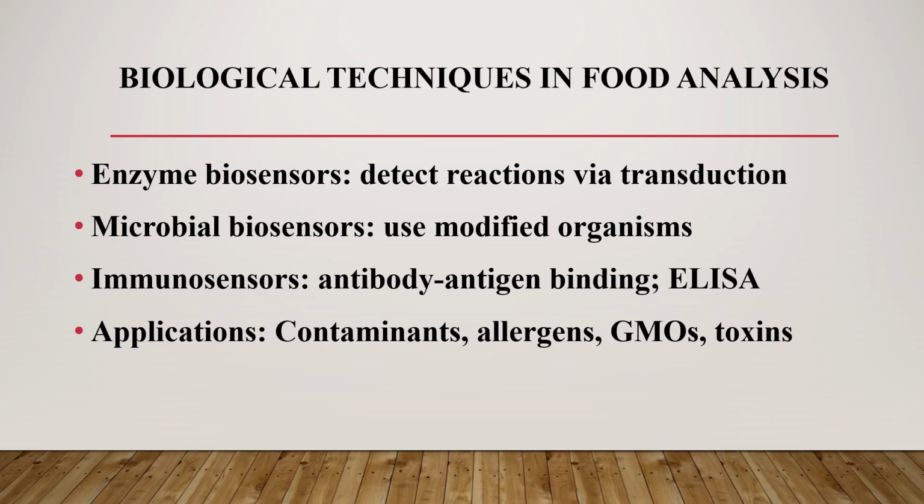The most common is ELISA, which produces a color change that is measured spectroscopically. These tools are used to detect contaminants, allergens, GMOs, and microbial threats. It's critical for food safety and regulatory compliance.